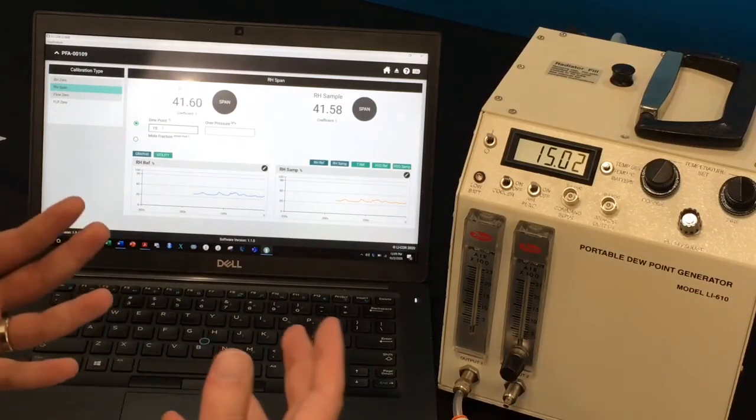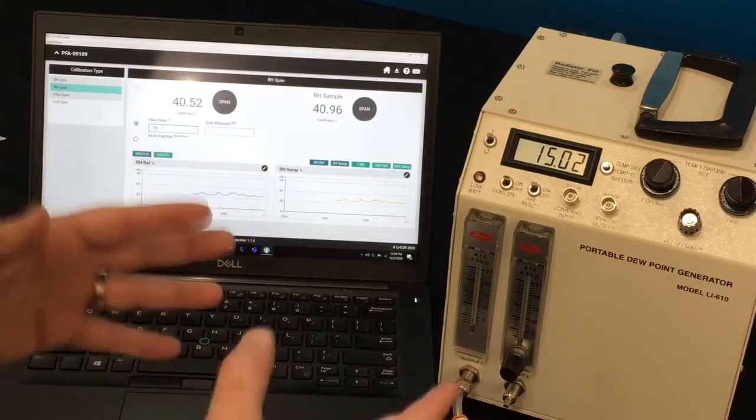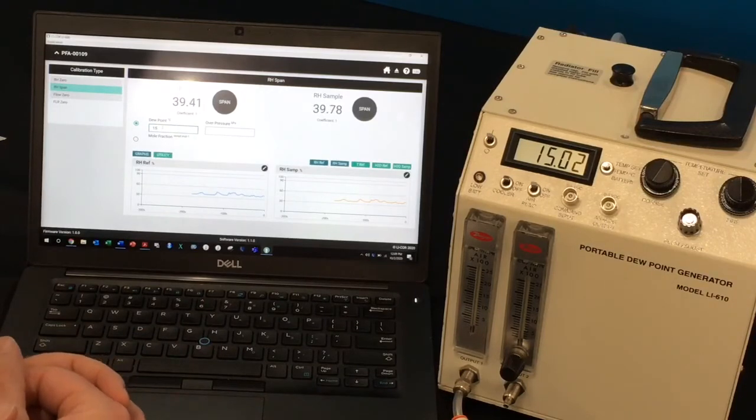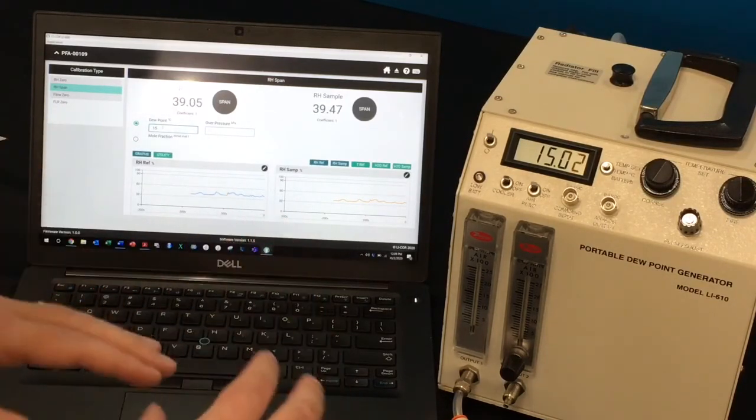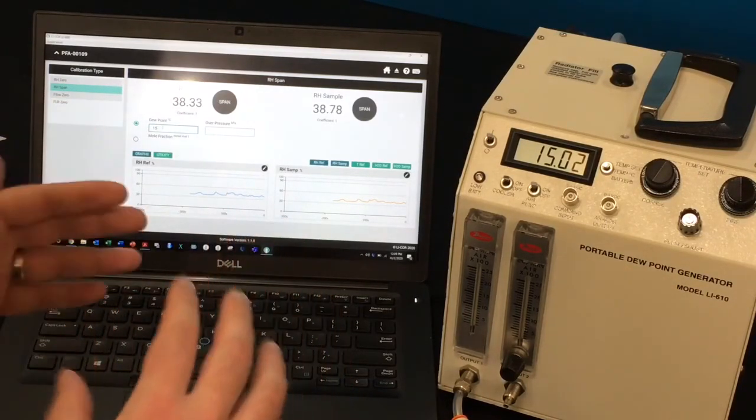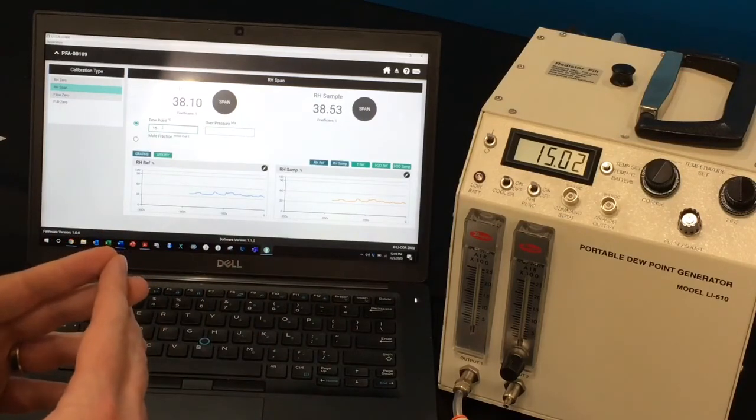Once you've finished the span calibration, you can disconnect the instruments, replace the calibration clamp with the leaf clamp, and you're ready to make measurements.